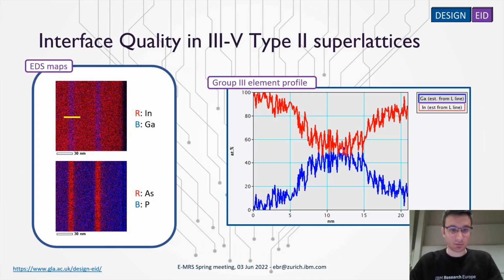Looking at the composition profile through the quantum wells for the 3 element, we can see how at the beginning, before the quantum well onset, the indium is a majority element. Through the first hetero interface, the concentration of indium drops until it reaches about 50% inside the quantum well itself. This is the concentration we were aiming for with the ratios between the 3 precursors during the growth. After the end of the quantum well region, the indium concentration again sharply raises and indium becomes the majority element.